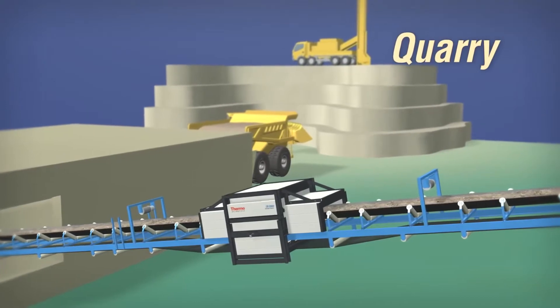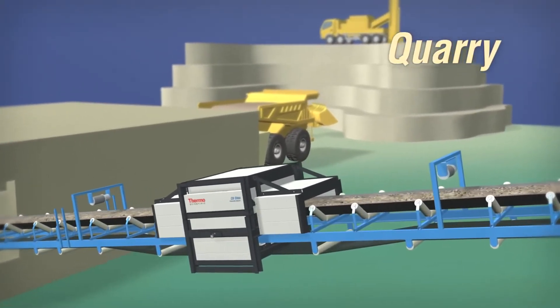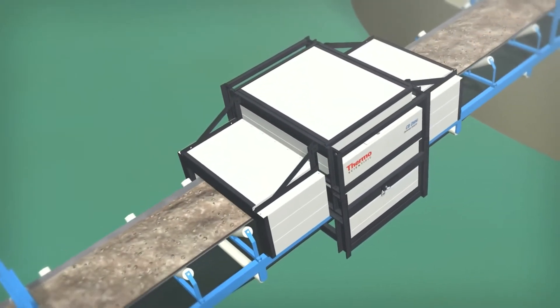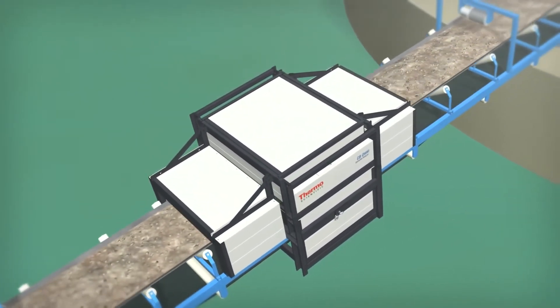In the quarry, the system can be used to sort materials based on raw material quality or, more commonly, to monitor and control the chemistry of a pre-blending stockpile.